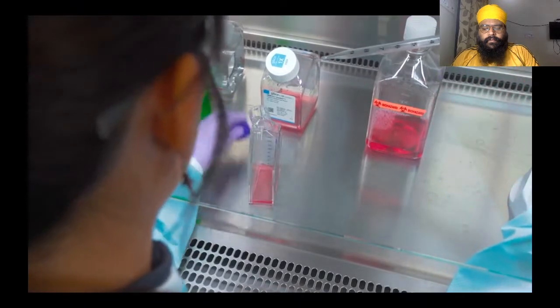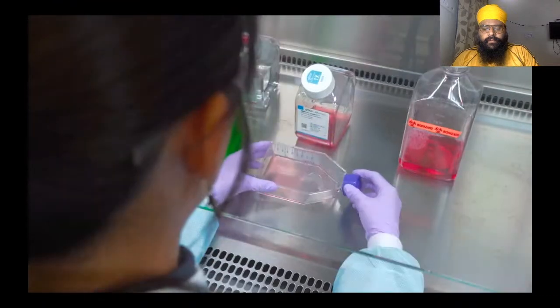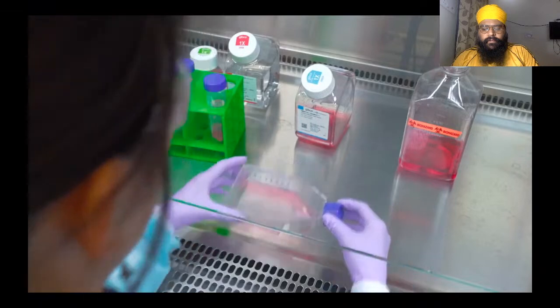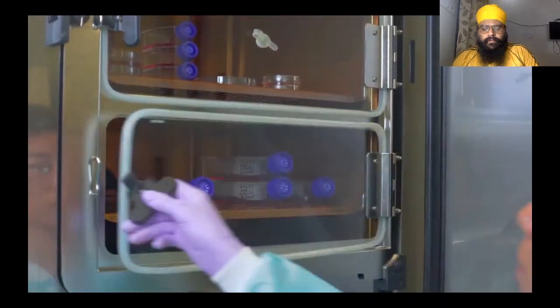Cap the vented caps on your flask tightly. If the caps are not vented, cap loosely. This keeps contamination out while allowing adequate gas exchange. Use a north-south, east-west motion to evenly distribute the cells and transport the flasks to the incubator.